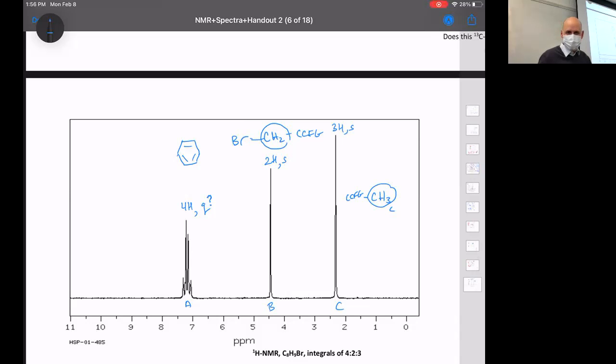Olivia, how many hydrogens are on it? 3. So the quartet tells you neighbors. What tells you about how many hydrogens are in? 4, yes. So there's a couple different ways to put 4 hydrogens on a benzene ring. But because you see this is so symmetrical, it probably means that your hydrogens are symmetrical as well. So most likely, the hydrogens look like this, where the whole thing will have something on the right and something on the left.